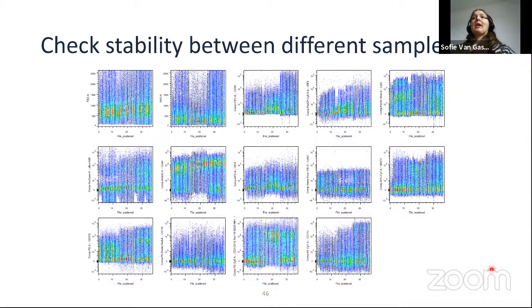So I just want to stress how important it is to check for these batch effects, especially if you're using automated analysis tools. Make figures like this one. You can also do a kind of PCA overview of your samples, these kinds of things. And test the things which you think would make sense. So for example, ordering them by the time when they were measured is very important. If you were measuring maybe on 2 machines, you want to make the plot ordering them first all of one machine and then all of the other machine.